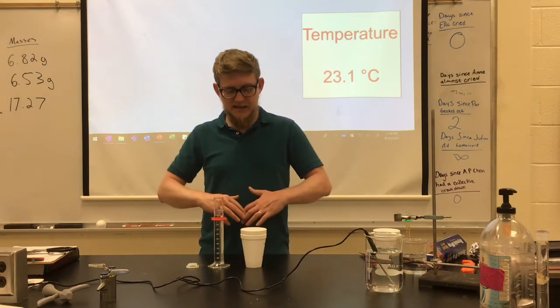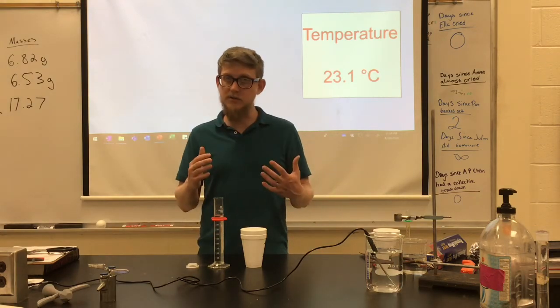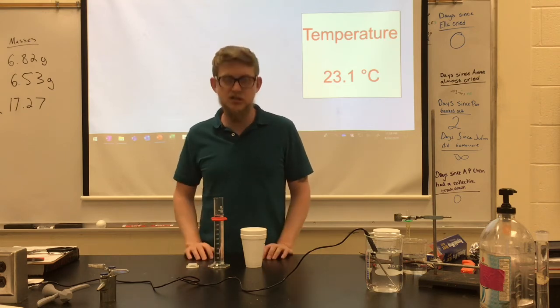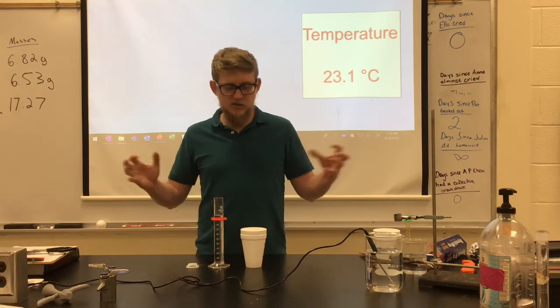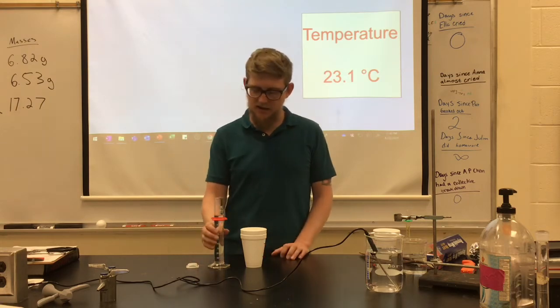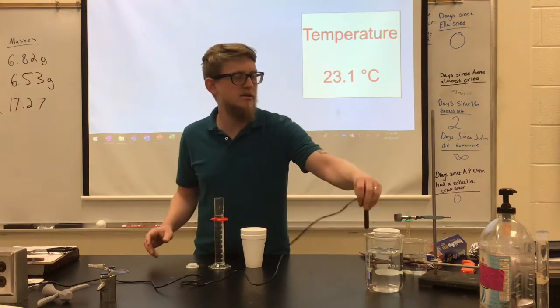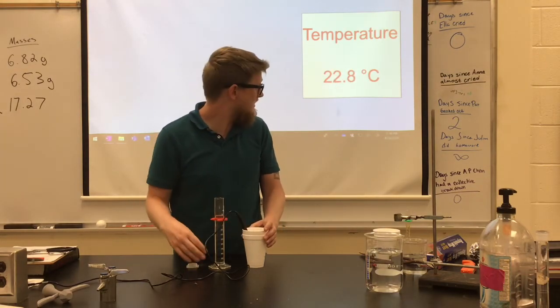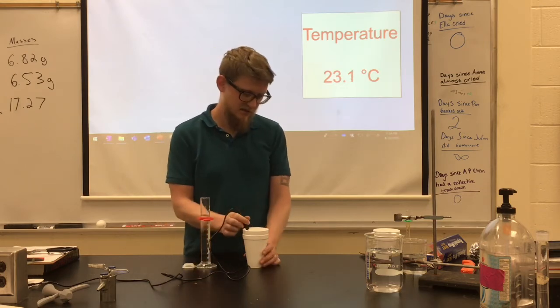All right, we're going to mix these together. It's going to create a solution with a total volume of 200 milliliters, and you will use that solution to determine how many kilojoules were either released or absorbed by the reaction. Okay, so let's find out. We're going to add this. Oh, first off, almost forgot. We need to put this into our base, like this.